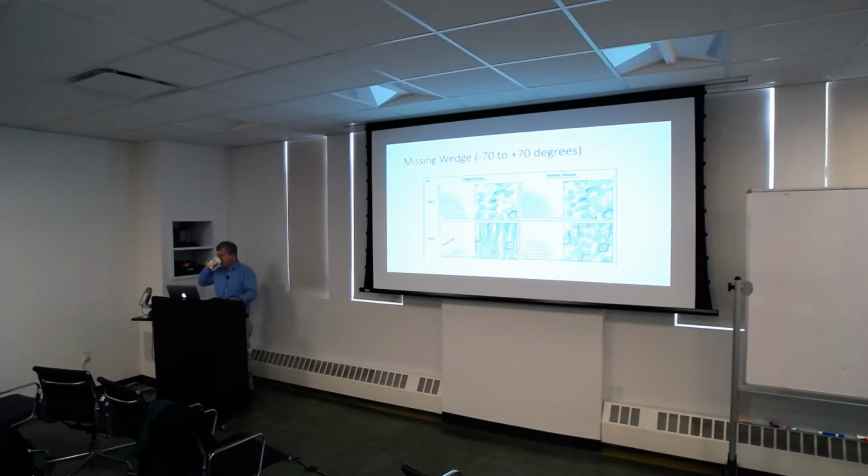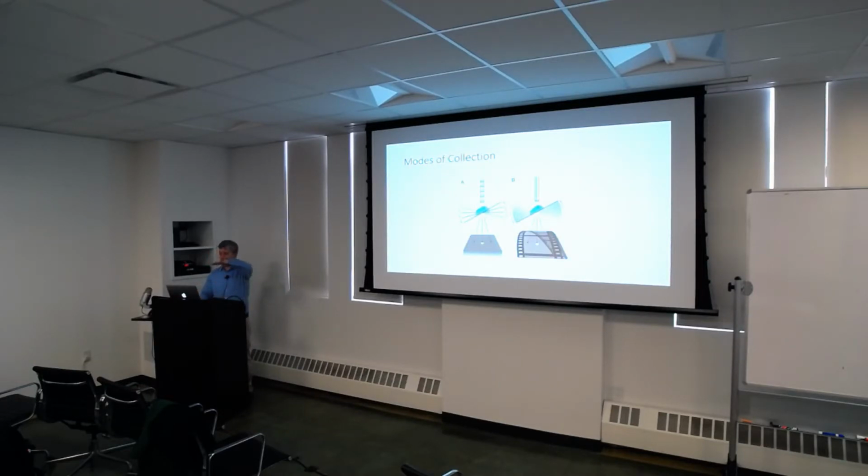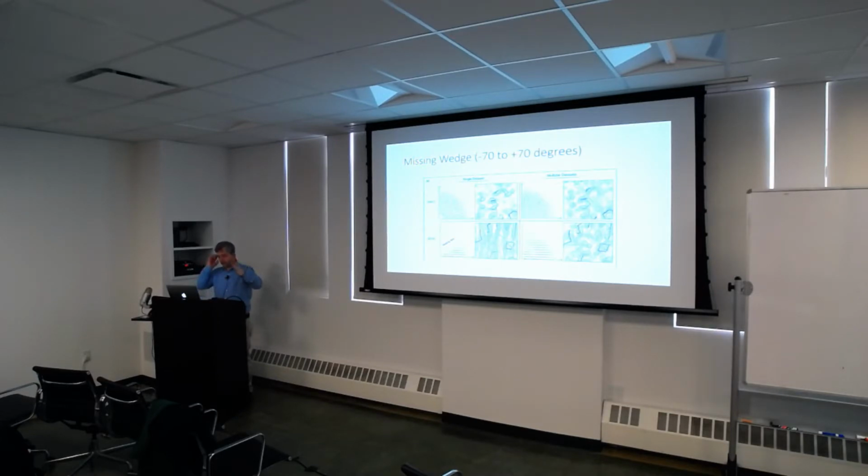The other thing is, because you still have your sample in the holder in the microscope, you are not free to tilt to 90 degrees, unlike with X-ray, where you could go from -90 to +90 or a little bit more, and you get the full 180. With a standard electron microscope, you're basically limited to -70 to +70 degrees. There's not too much you could do about that unless you had something where it was on a pin or something, but that would be hard. Yeah.